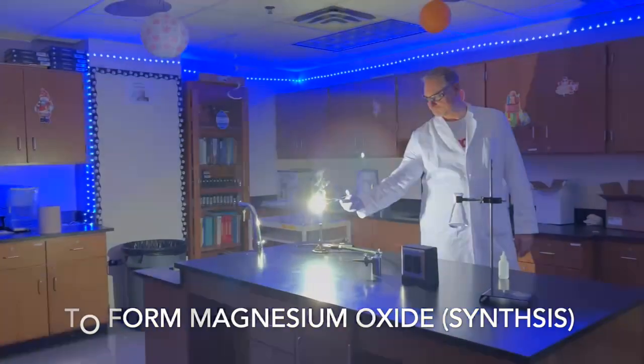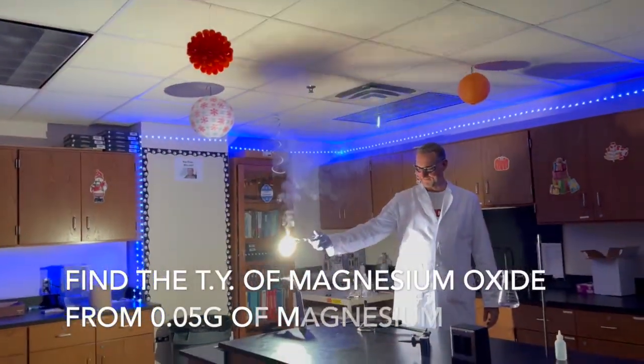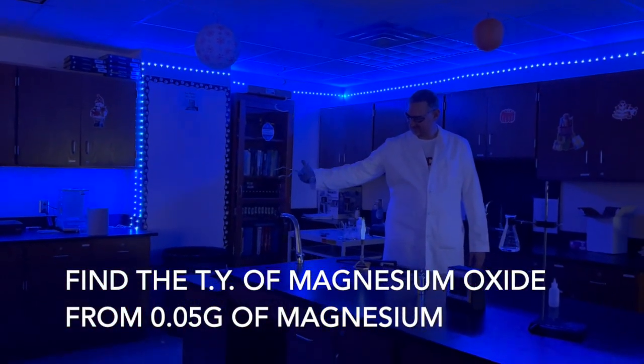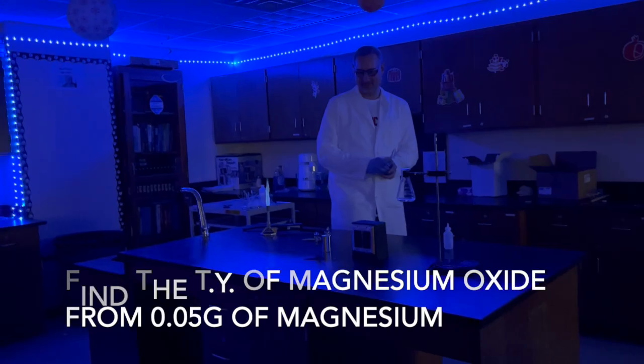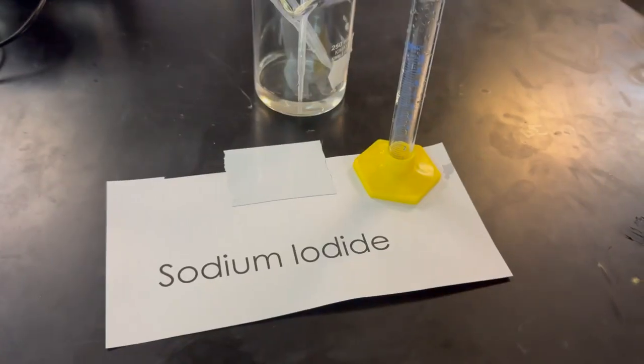Be careful when you write this reaction out that you pay attention to things like diatomics and swap and drop for the recombination. For this one here, you're going to use 0.05 grams of magnesium.